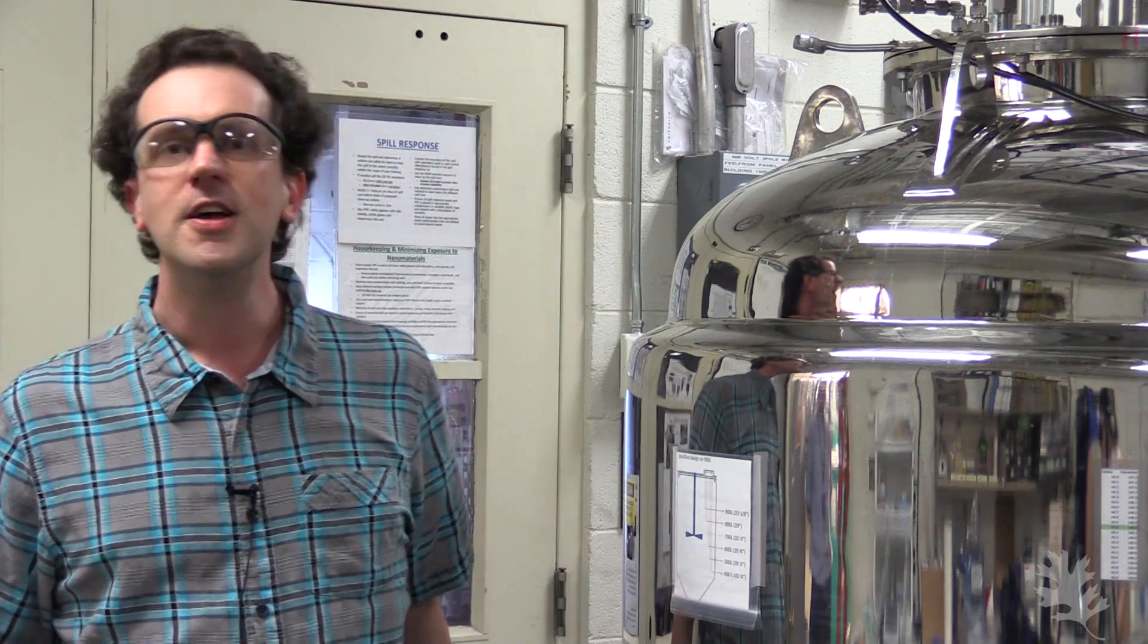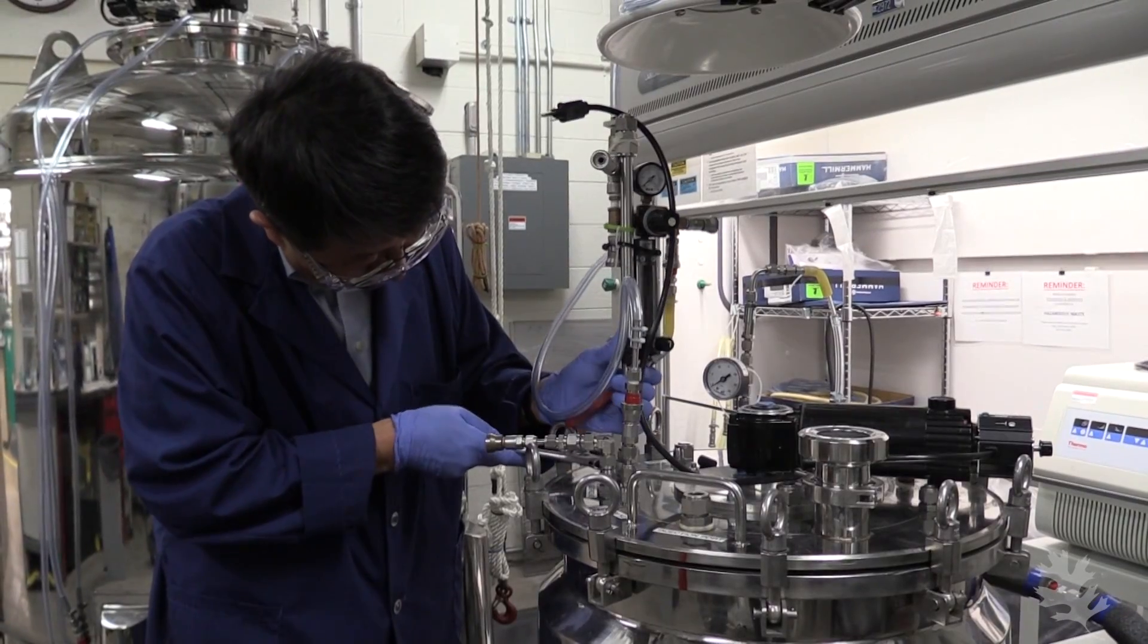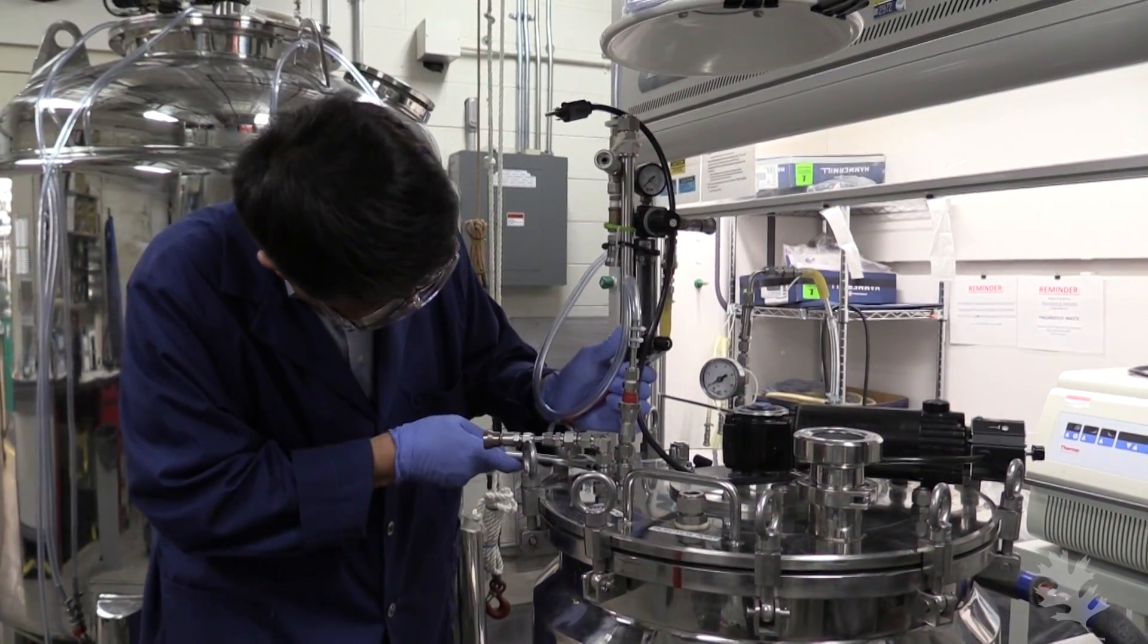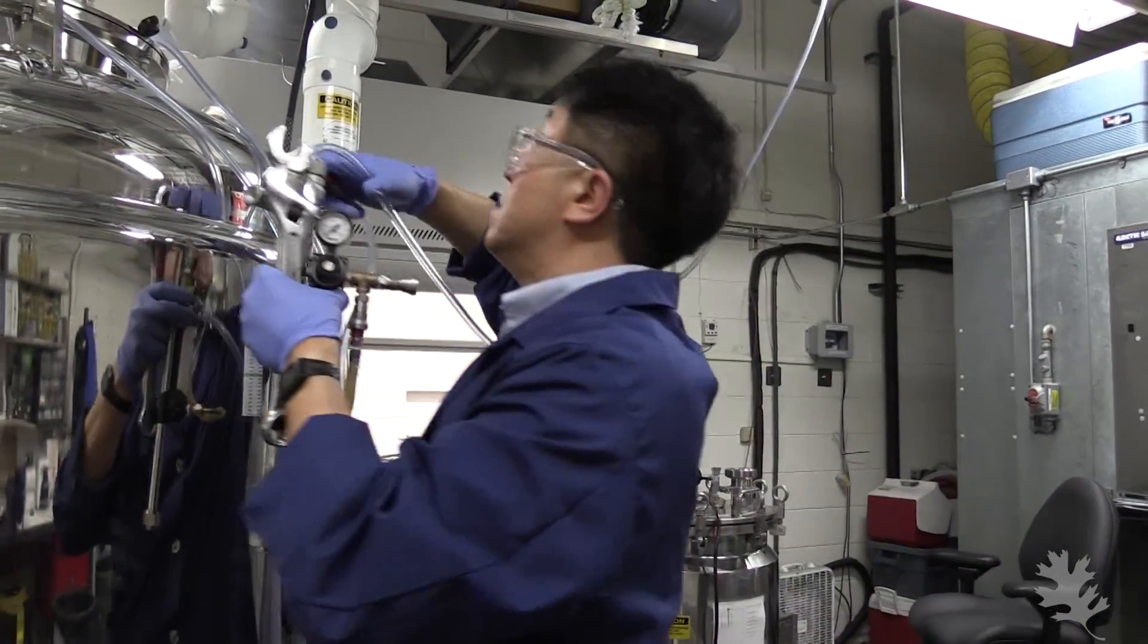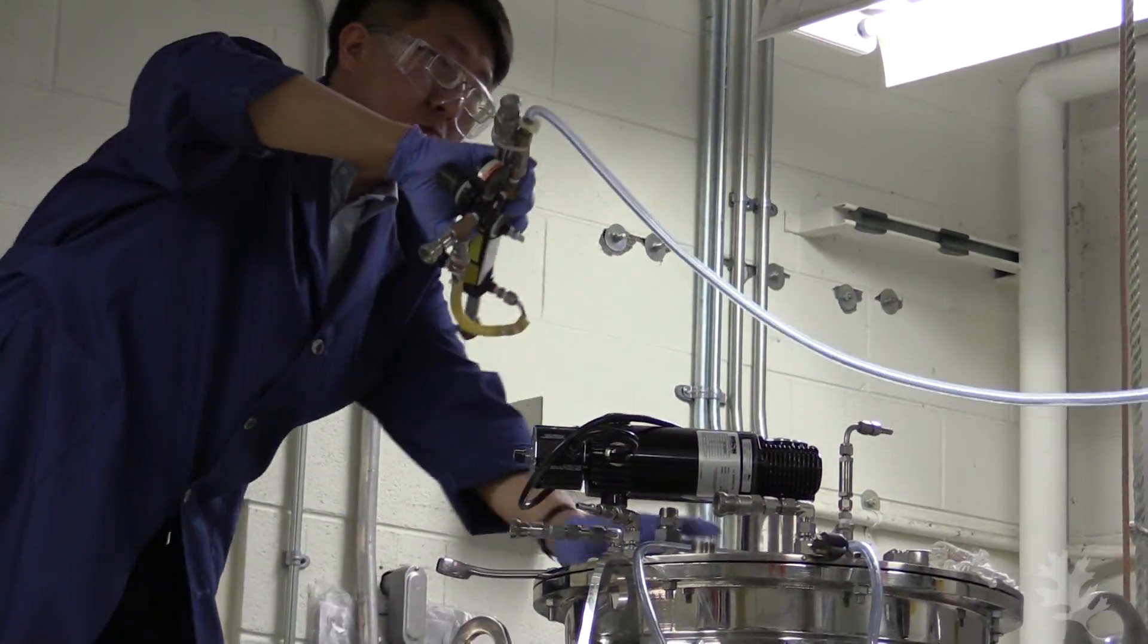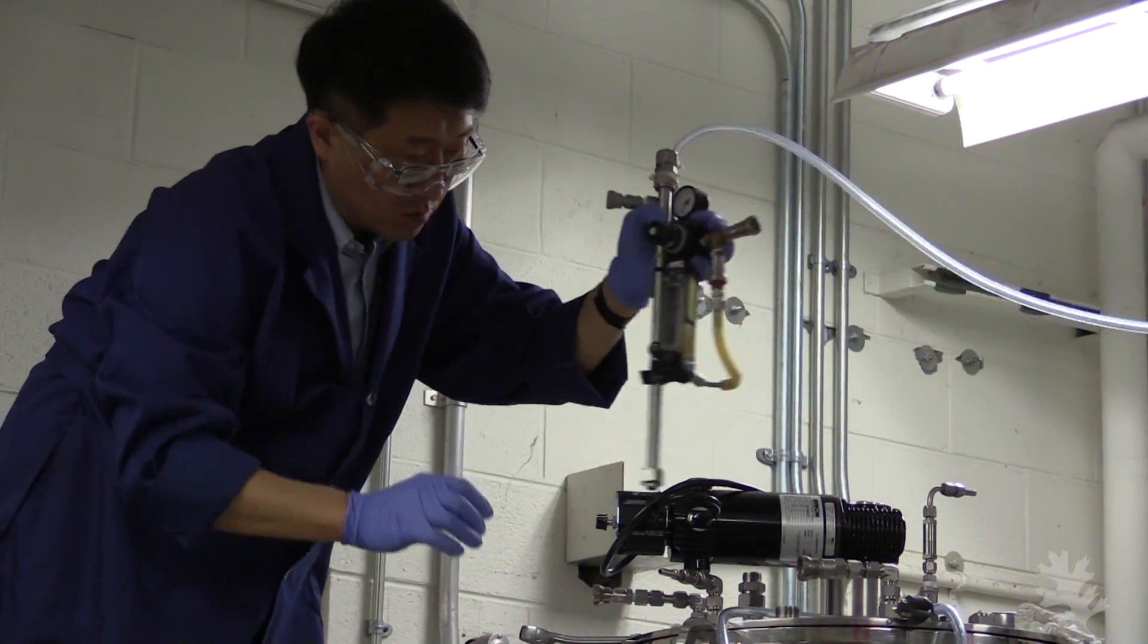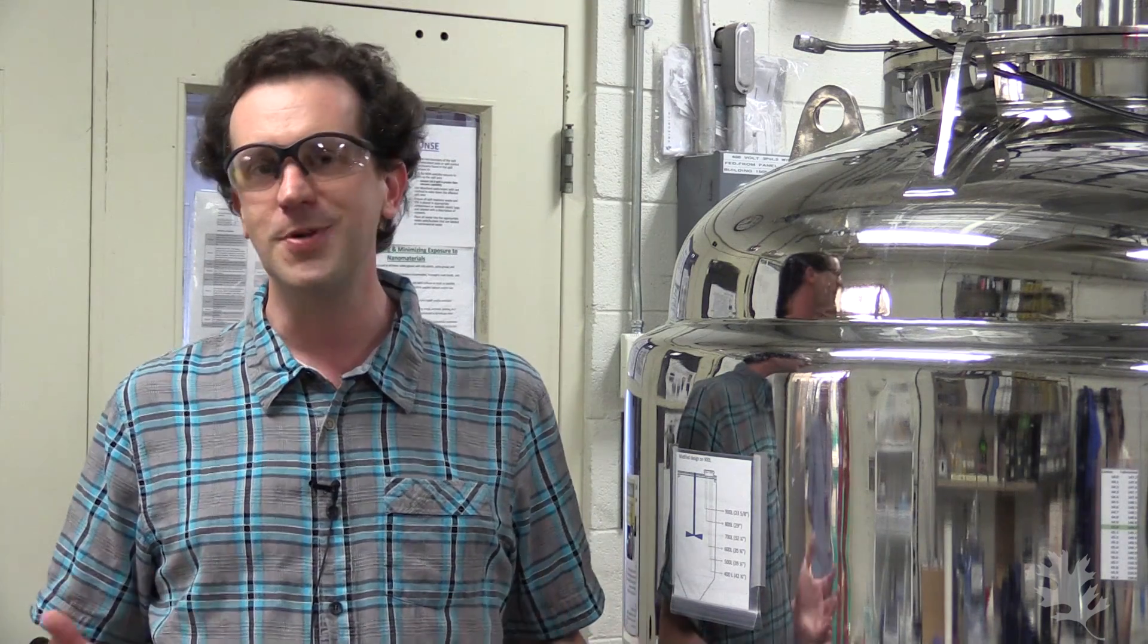This reactor demonstrates the pinnacle of years of work by Jiwon and our collaborators to manufacture these materials in quantities relevant for testing in smaller scale reactors, developing processes that use as few valuable chemicals as possible to achieve the greenest possible chemistry.